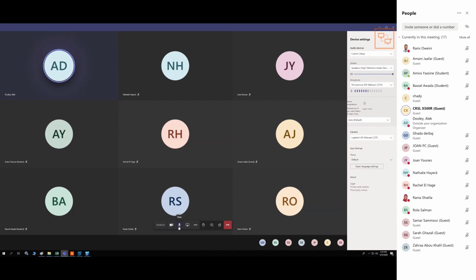Thank you, Alek, for that. Yeah, no worries. I think it's better to do some processing on the Explorer end and then move on to the unknown. Okay, great. The Explorer also has an excellent PDF tutorial. So it really takes you step by step because the Explorer is the same as our very old software called PeakView. So that is really nice. There is a really well-written PDF for that. Unfortunately for analytics, there is no PDF.